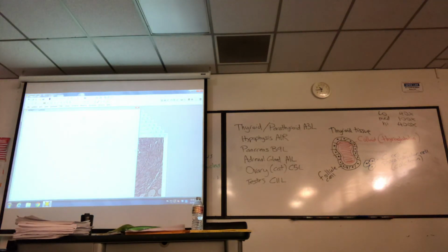Go back to the little man, lower the stage. Rat testes is what we've got here.